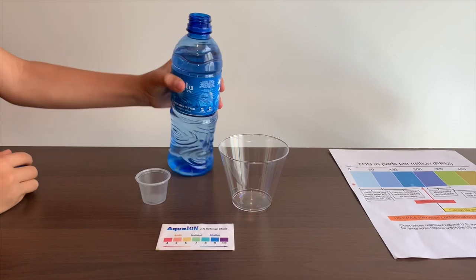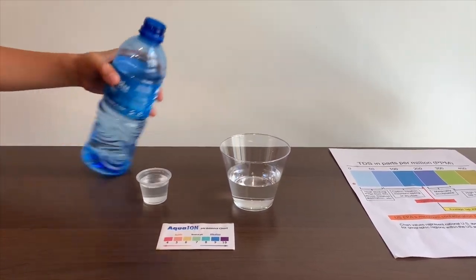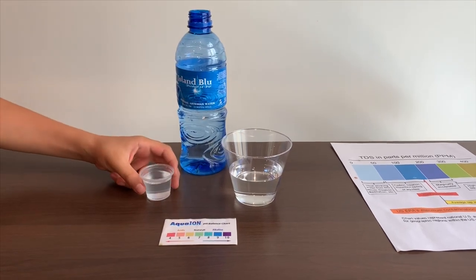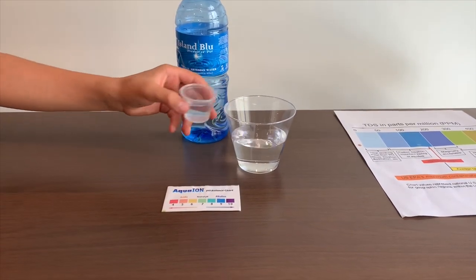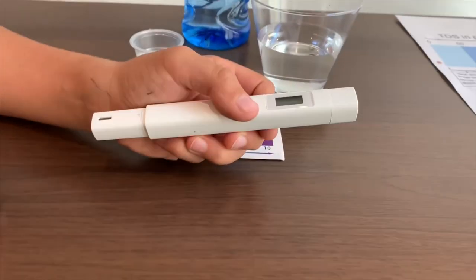Let's pour some water in. This is a little too much for the pH cup, so let's pour some back into the TDS cup. If you want to buy this TDS tester, check the link down below.